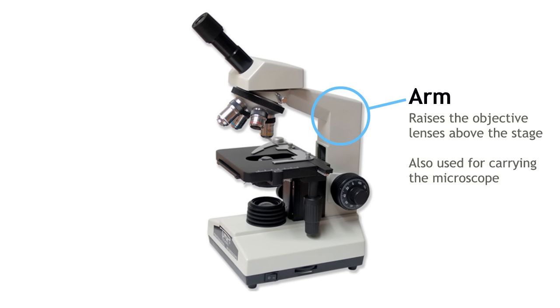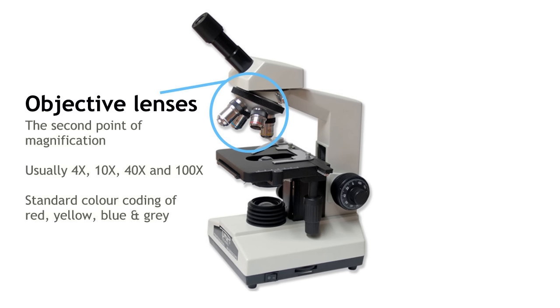The objective lenses are the second point of magnification. They revolve around on what is called the nose piece. There are usually 4 objective lenses, color coded for easy recognition. The 4x is red, 10x is yellow, 40x is blue and the oil immersion lens 100x is grey.